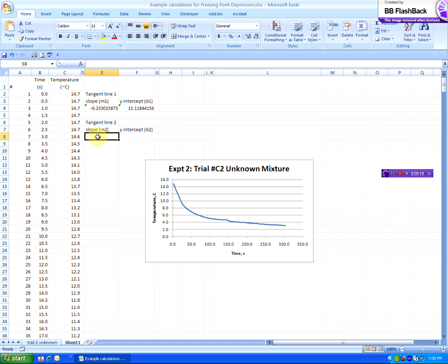Now when we collect the data for the slope, we only need this portion of the data, so I'm looking for the flat part of the line through here. So maybe we should start collecting the data about 160 or so. It's kind of flat from about 160 seconds down to 300. You notice that again is kind of arbitrary too. It doesn't have to be exact.